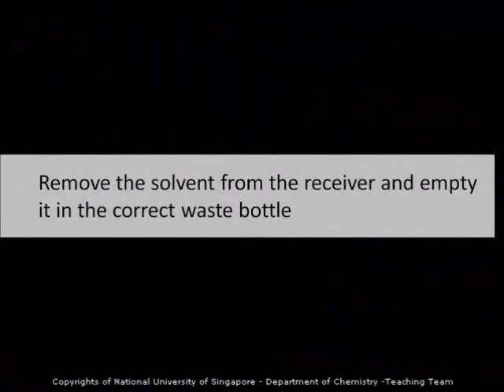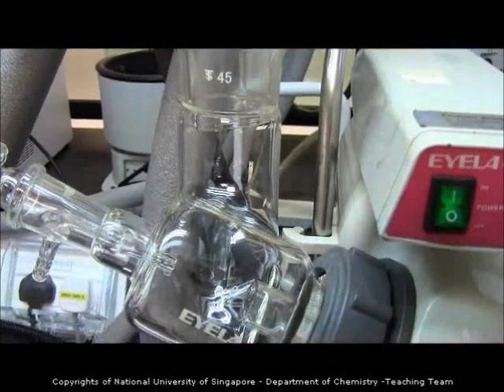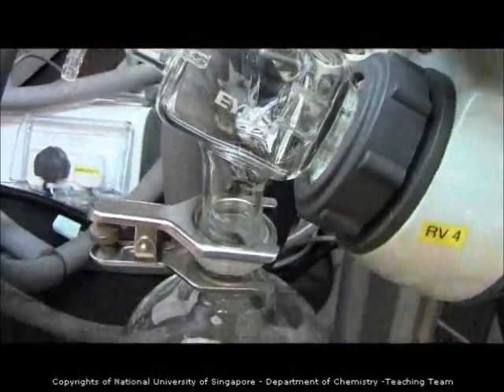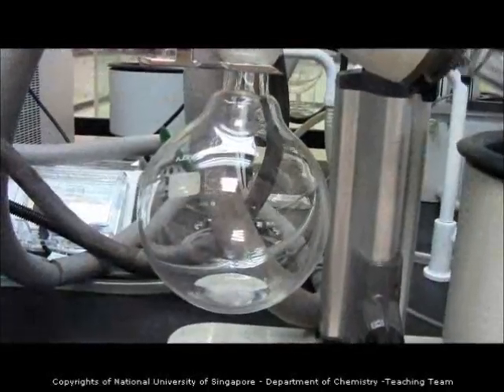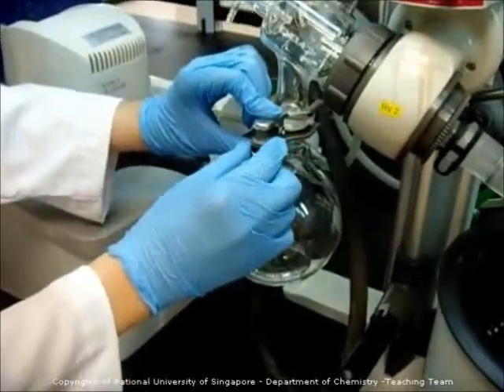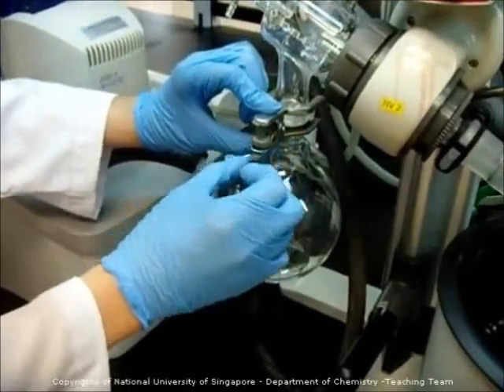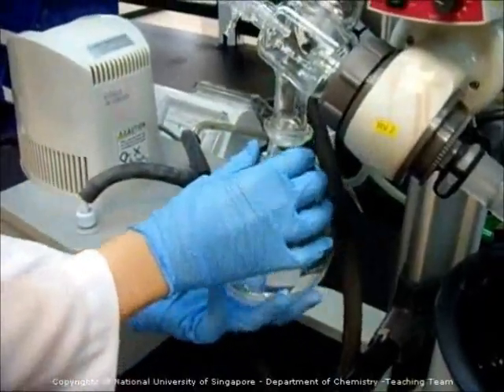Don't forget to remove the solvent from the receiver and empty it into the correct waste bottle. Your solvents have been collecting in the receiver, and the next user may not use the same solvent as you. So it is very important to remove it and empty it into the appropriate waste bottle. Loosen the screw of the clip at the receiver with both hands, remove the clip while holding the receiver, and use both hands to rotate the receiver out.